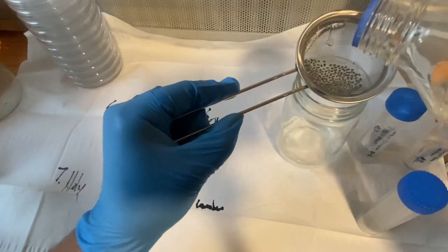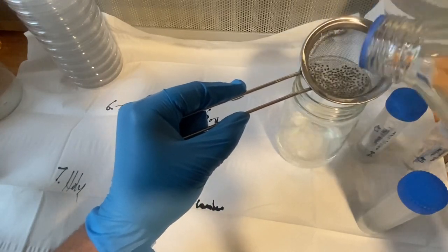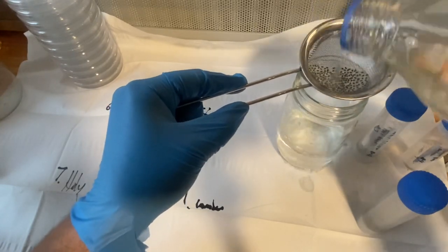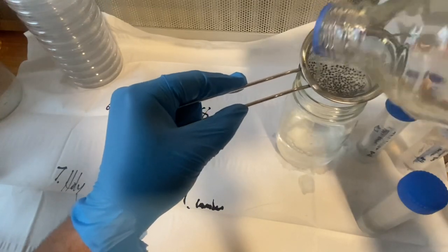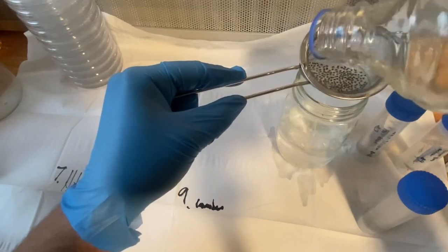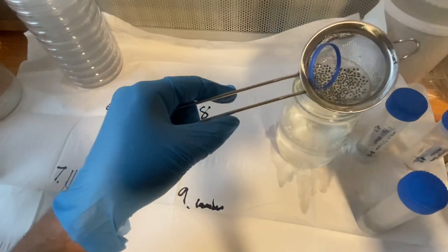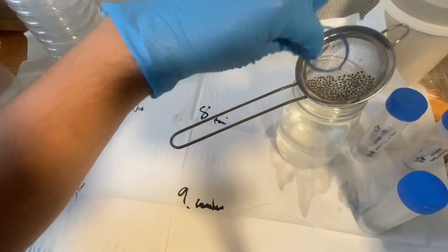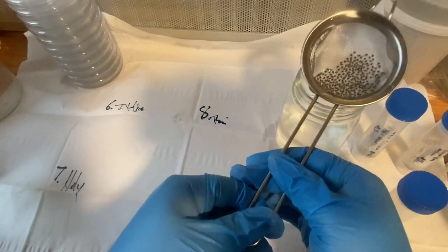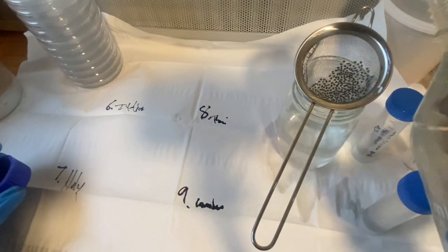Again, with the basil, it can be a little hard because they have that gelatinous coating. So kind of just gently do this. And then as you can see, I already labeled all of the drape. And I'm just gonna flip it in that section just so I can keep track. Looks like that O-ring came right off. It's okay. Okay. You should give it a really good rinse. If you have lots of sterile water, don't be afraid.